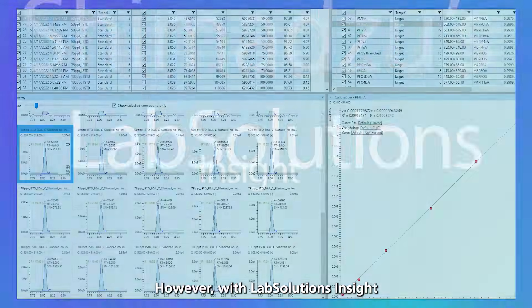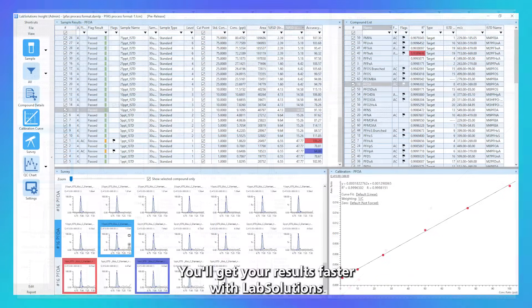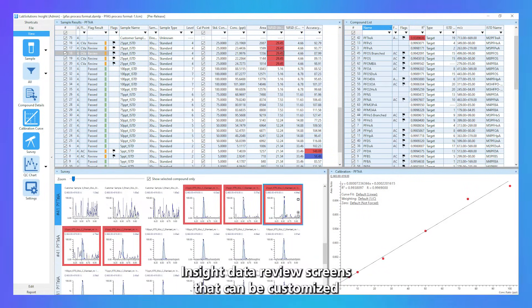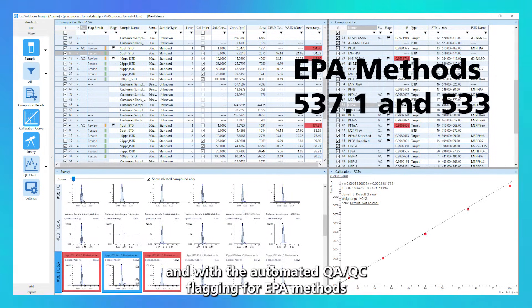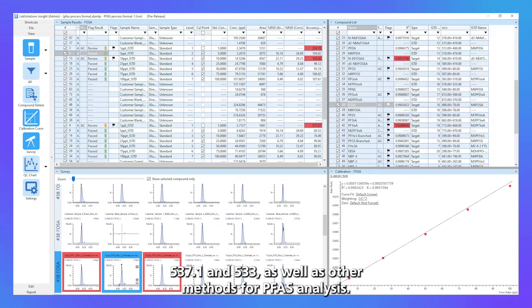However, with Lab Solutions Insight, you can streamline the process and focus on samples that need critical attention. You'll get your results faster with Lab Solutions Insight data review screens that can be customized, and with the automated QA/QC plugin for EPA methods 537.1 and 533, as well as for other methods for PFAS analysis.